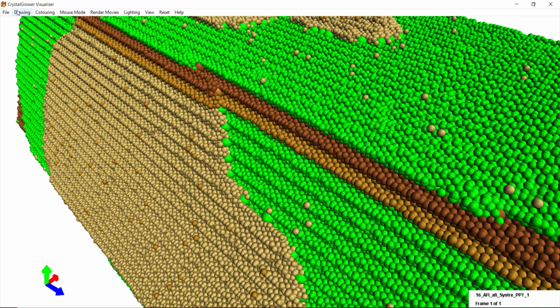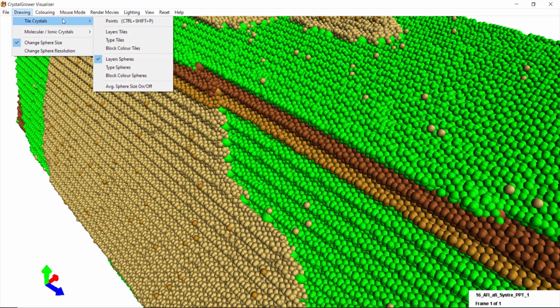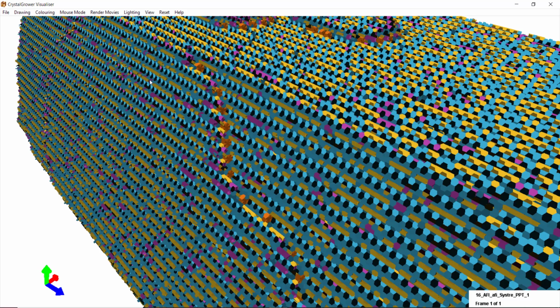So these options also translate to the tile drawing. So if we go to type tiles, I'll go through the same options here. If I press space, it'll show a certain tile type has been selected and it'll tell you which tile out of all the tile types that has been selected. We can recolor these tiles through the same mechanism.